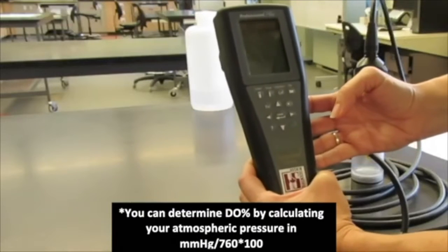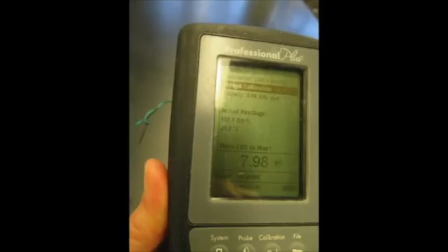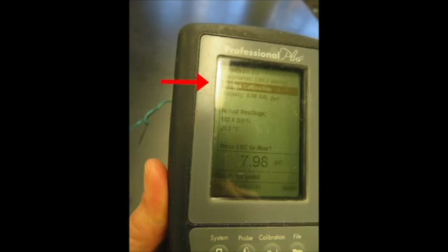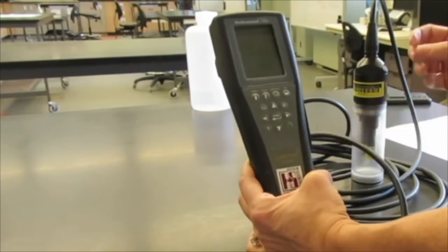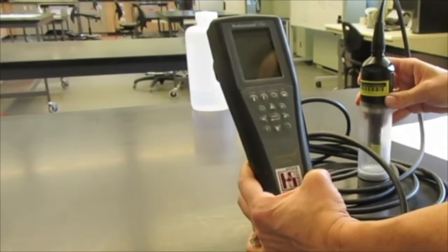Now we can view and see if the dissolved oxygen percentage appears okay. For U Waterloo campus in our area, this ranges from 88 to 110 percent. Since we are satisfied with that reading, we are going to accept the calibration and hit enter again. This brings us back to our main screen where we can go out into the field to our field sampling location.